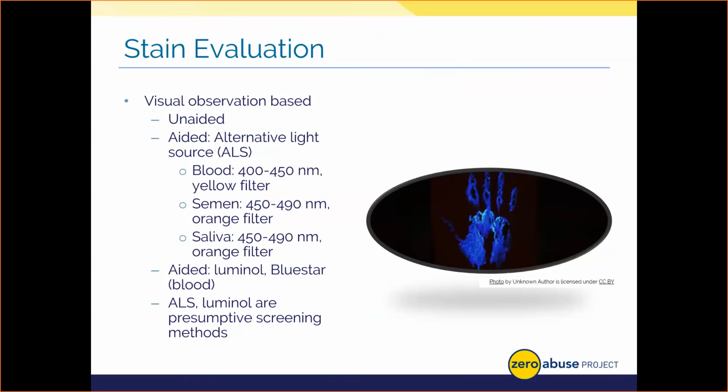There are expensive models of ALS that are benchtop or tabletop based and reach a wide array of spectra, or different wavelengths of light, down to, believe it or not, portable torches that can be used on scene. They're handheld. Now, the following spectra of light that you see here in filters are just examples of the type of ALS wavelengths and filters or goggles that we'd use to detect the following body fluids. Note that body fluids are variable in terms of ALS detection. There's a wide range of filters and wavelengths that we can use.